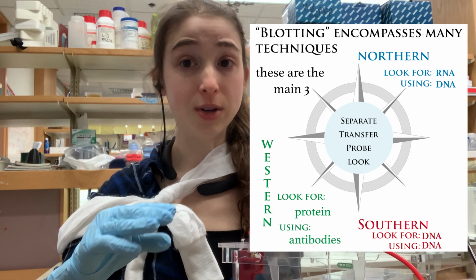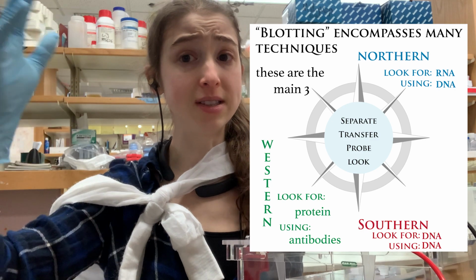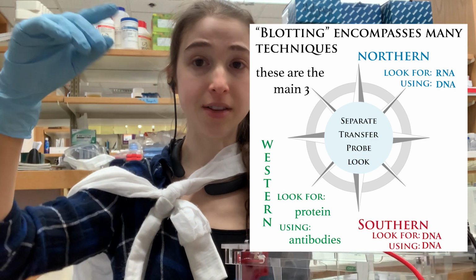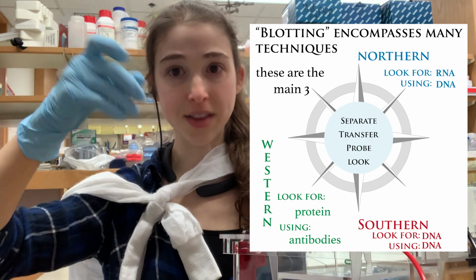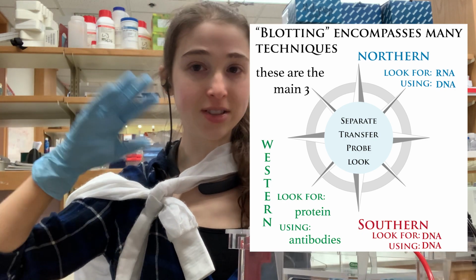Our southern blot, which is the original blot, and the southern actually comes from the name of Edwin Southern, who actually invented this technique in the 1970s, and then the other names are just kind of like puns off of that one. So only the southern actually has the capital S. The rest have like a lowercase letter, just technical wise.